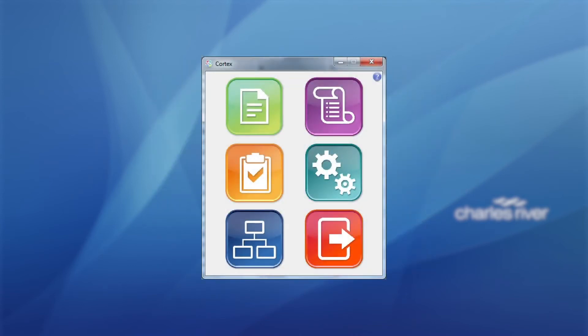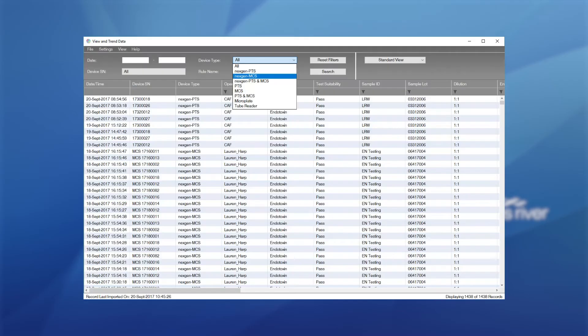Cortex should be set up to automatically import data from EndoScan-V. From within Cortex, click on the icon for view and trend data. From within this screen, utilize the gray filter area at the top of the screen to choose all NextGen MCS results from under device type.